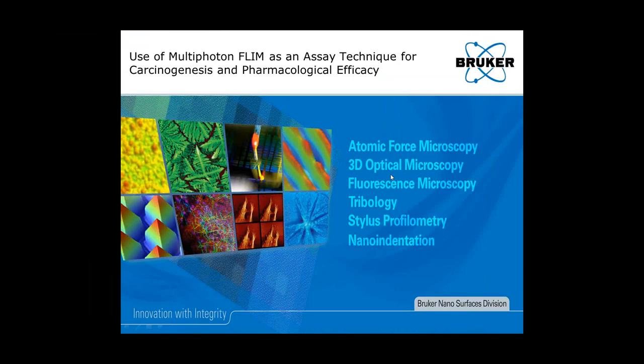All right, thank you, Jeff. So I'm going to start with an overview of fluorescence lifetime imaging as a technique by itself, and then how we integrate that into our Bruker fluorescence microscopy systems, mainly multi-photon systems.